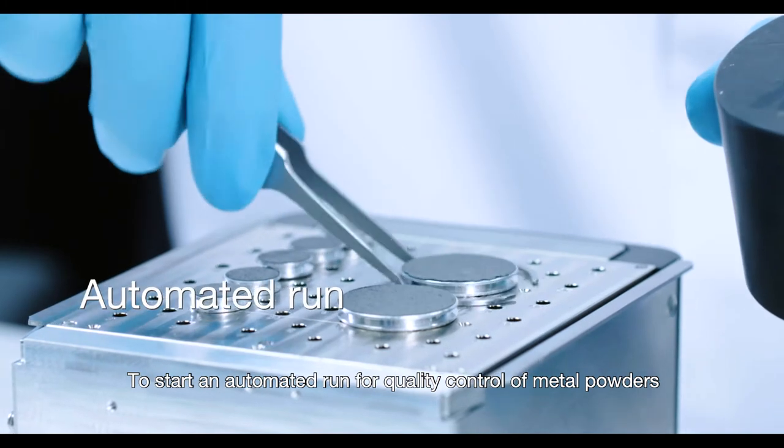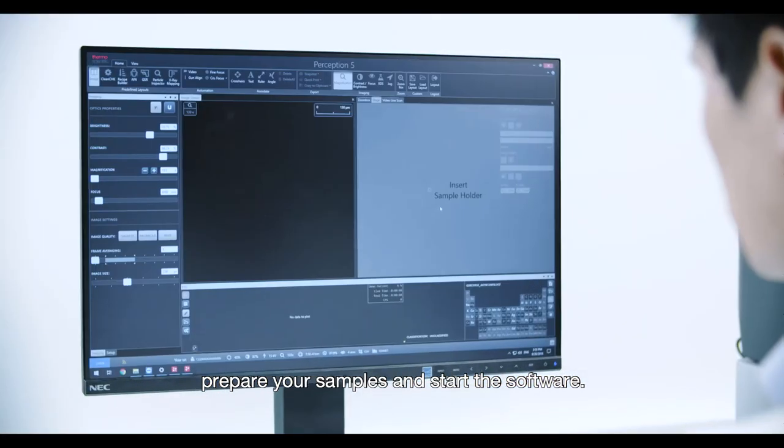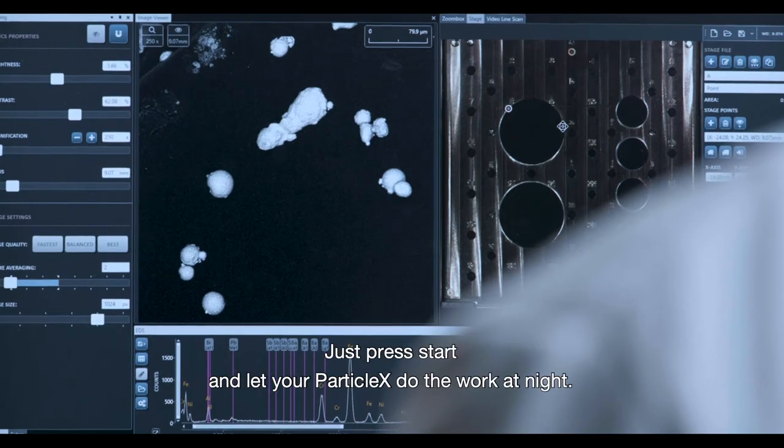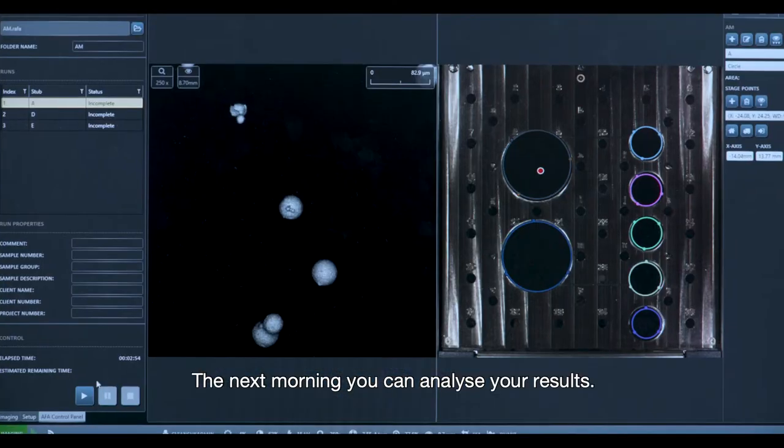To start an automated run for quality control of metal powders, prepare your samples and start the software. Customize your recipe for more in-depth investigation, just press start, and let your Particle X do the work at night.